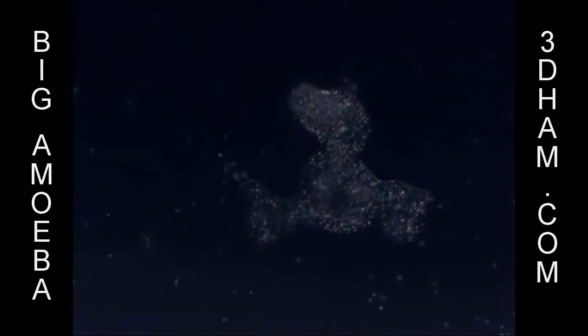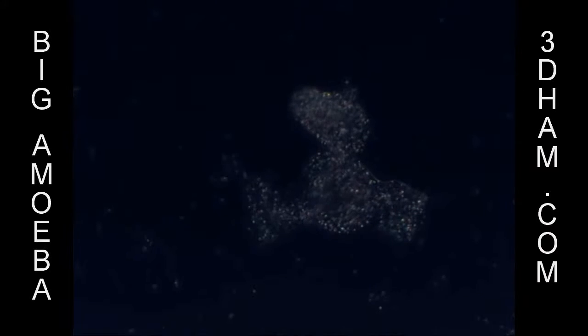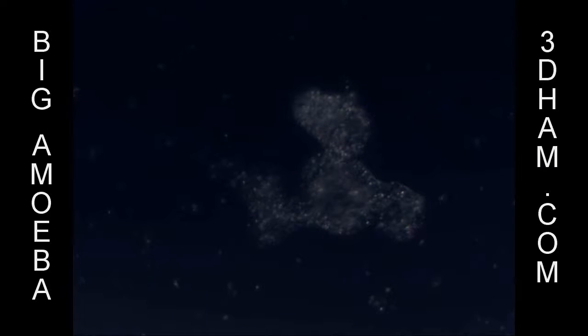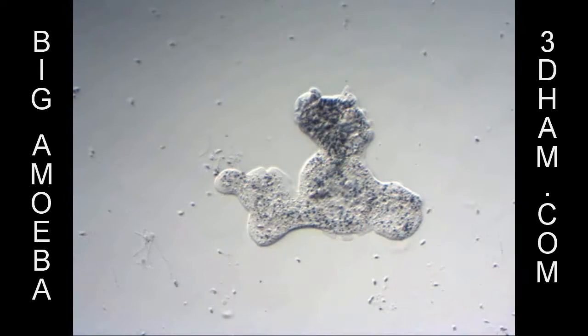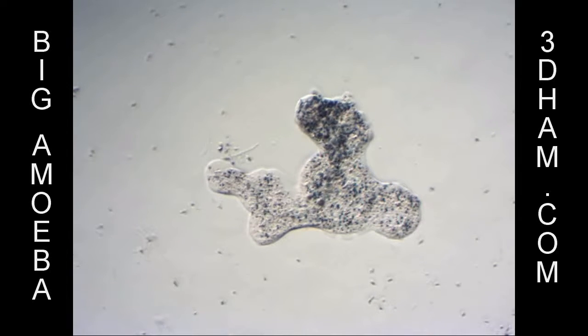It is fascinating to watch how the amoeba moves, and in particular how the pseudopods react when the amoeba changes direction. Of course, the amoeba doesn't have a nervous system, so you kind of wonder, how is it that it manages to coordinate these movements? Well, that's one of the big mysteries of amoeba.